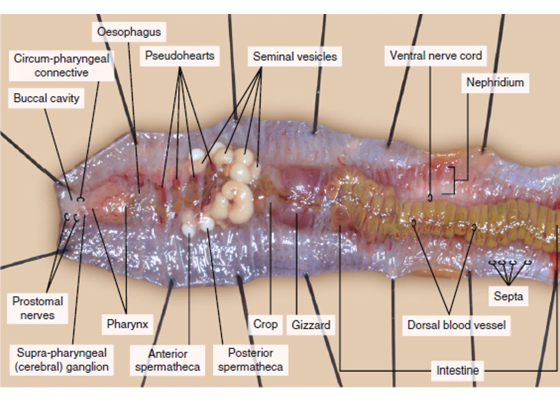The first structure that appears is the three pairs of cream colored seminal vesicles. Here we can see them, and they are used for storing the sperm produced by the same individual.